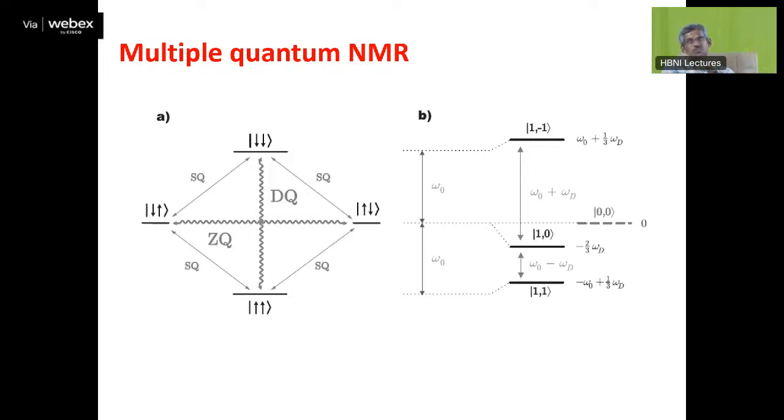In the case of a phosphorus nucleus in a phosphorus glass, I explained to you how a DQ NMR works. What is DQ NMR? DQ NMR is simple, it is nothing but double quantum NMR. How can double quantum NMR give information regarding the coupling constant? You can see the literature, the notes or the slides, and if any doubts are there, you can write to me or contact me. But double quantum NMR is an ideal technique to monitor the dipole-dipole coupling.